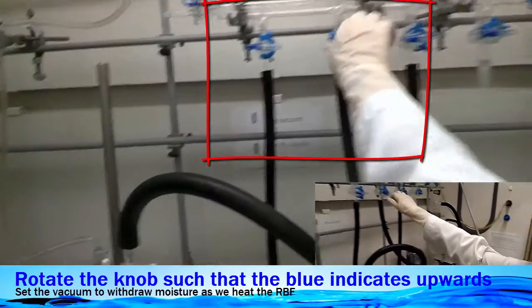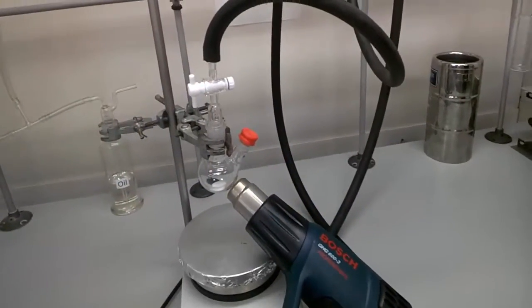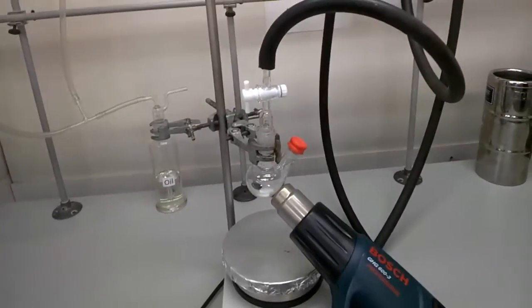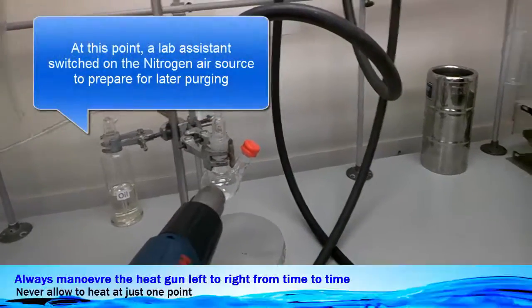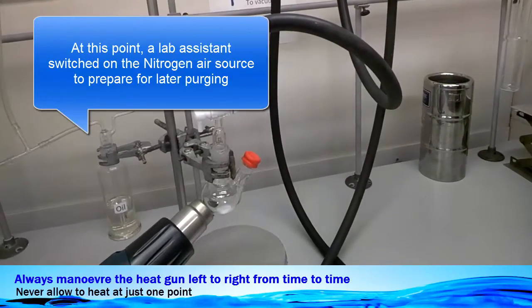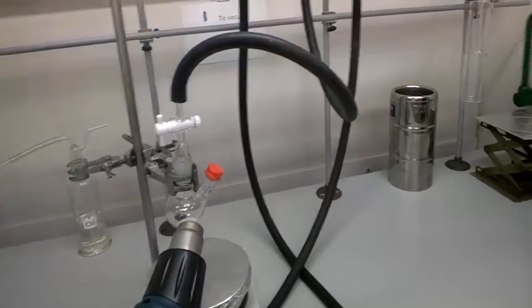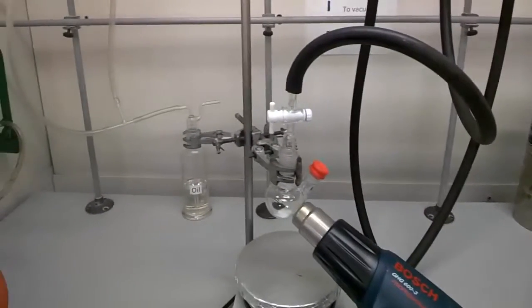Once done, rotate the knob of the vacuum line. Now this is the heat gun, and once you're ready, make sure everything is secure. We aim at the base of the glassware and switch it on by pressing the button. Notice how we rotate the heat gun so that it does not concentrate all the heat at one spot — make sure it's all evened out.